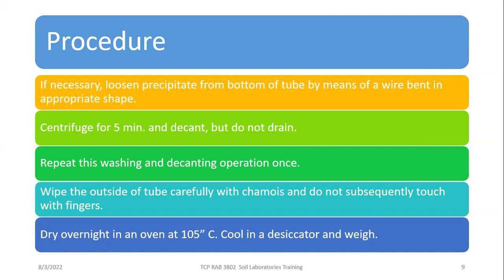So I try to give the theory and the procedure because it is very similar to the determination of gypsum by the gravimetric method.